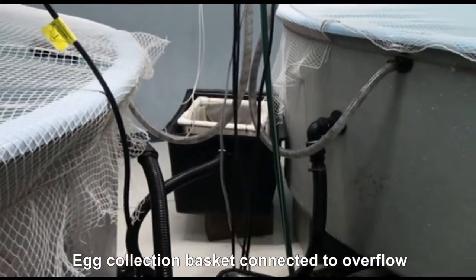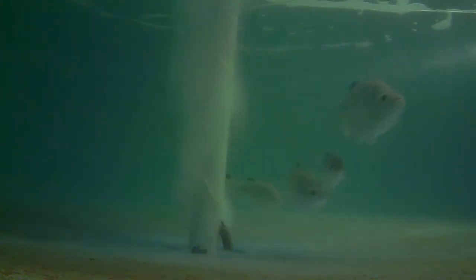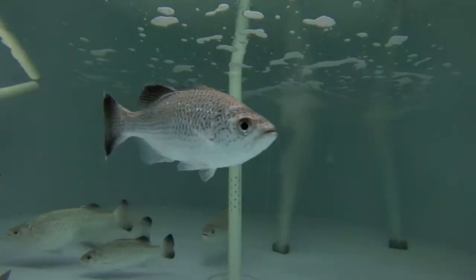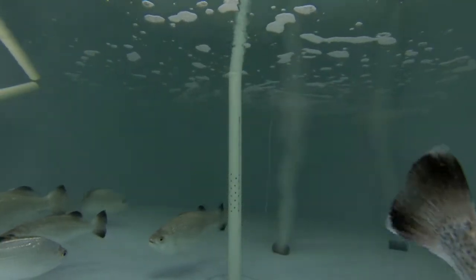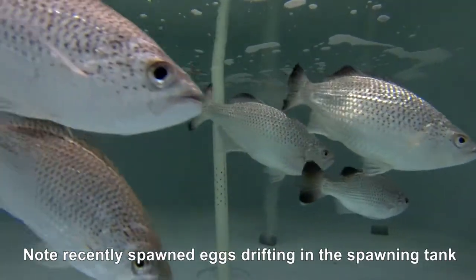Overflow tank water into a 300 micron mesh egg basket set into a tub. The spawning tank should be heated to 28 degrees Celsius and well aerated to keep eggs in the water column. On average, spawning occurs about 56 hours after hormone induction.